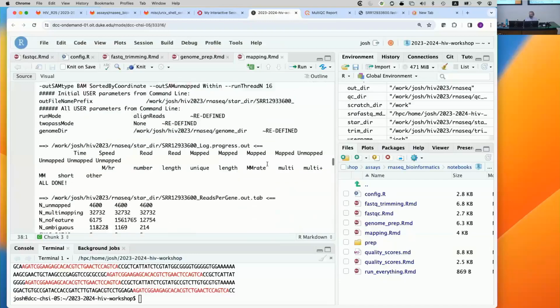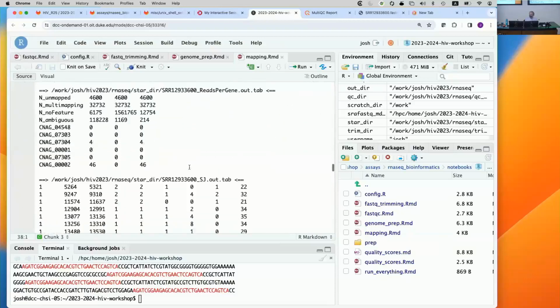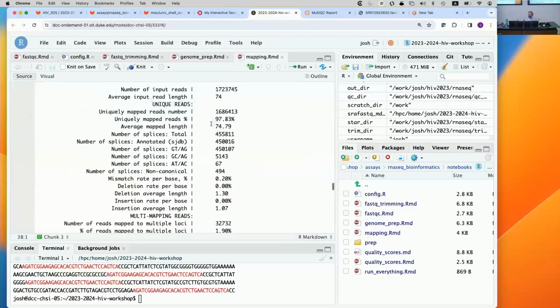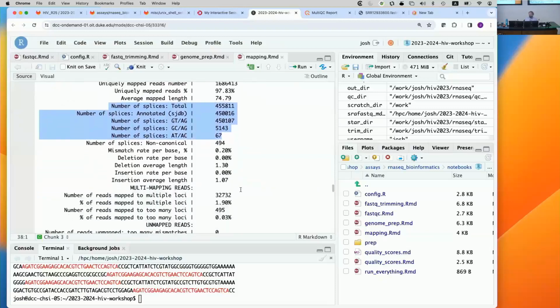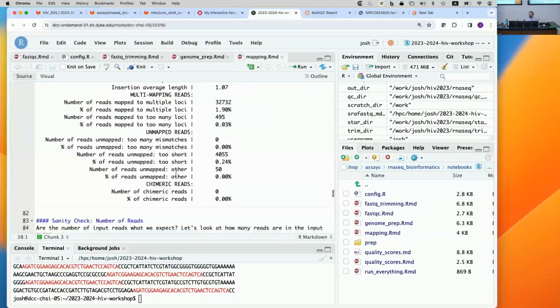There's actually a lot more information. This is a log file, sorry. There are a lot more details. Here's a little bit of the output, right? So here are the actual counts for the different genes. This we don't care too much about. And here's some more details that it's outputting for us. If I remember correctly, it's discovering new intron exon junctions that aren't annotated. You have to take those with a grain of salt. Here's some information on the multi-mapping and the unmapped reads.